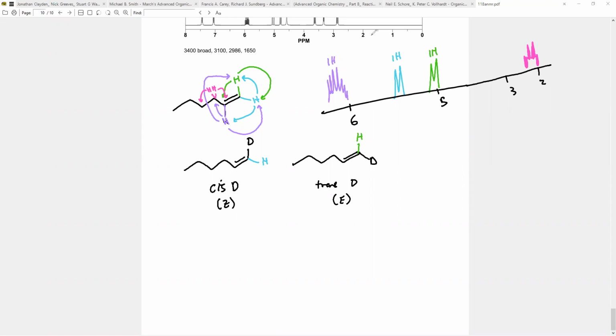Yeah. So this is where that little trick comes in, where if you have an alkene in your molecule or even an alkyne in your molecule, because of the weird nature of alkenes, of pi bonds, and how they talk to other protons, what we tend to experience is this complex splitting.